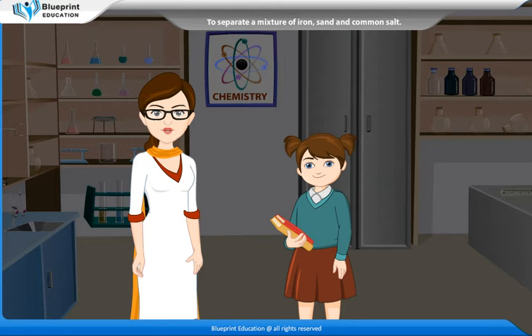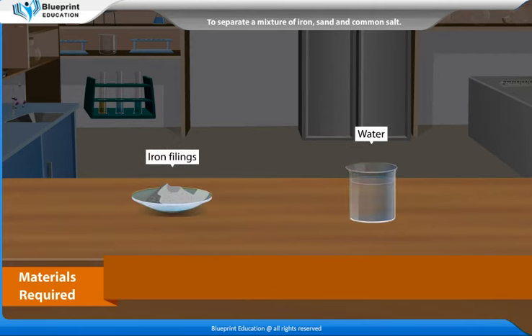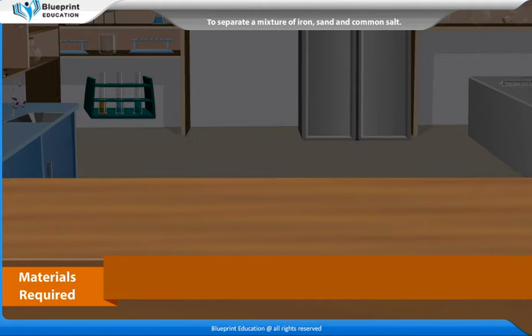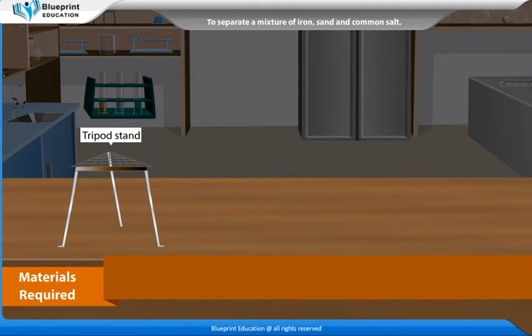Let's do an experiment to separate a mixture of iron, sand and common salt. The materials required are a bar magnet, sand, iron fillings, water, common salt, a funnel, a conical flask, a beaker, a wire case, a filter paper, a tripod stand, a china dish and a Bunsen burner.